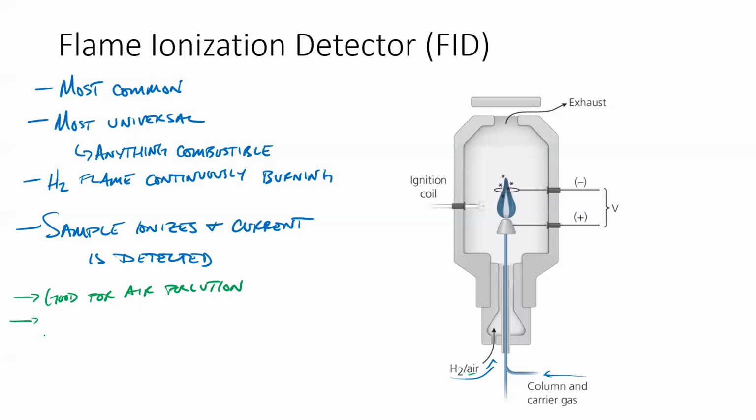It's also good for water pollution, right? I'm going to put in water. Because since water is the product of this H2/O2 combustion, there's lots of water already in the system. It doesn't really detect water very well.